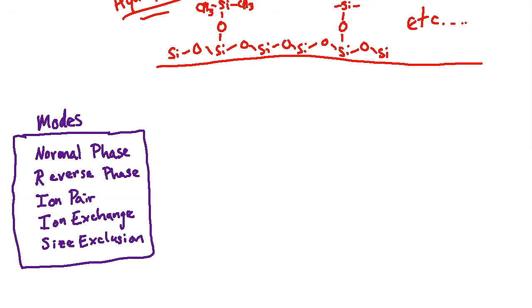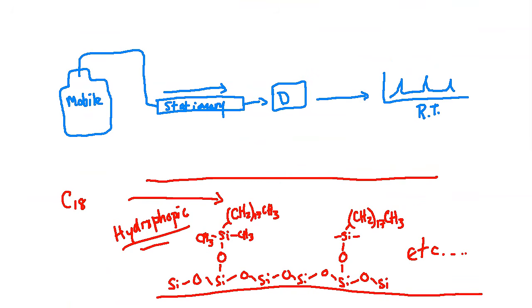So with that being said, I want to bring up an image here as we get ready to start wrapping up this first lecture and really go through each of the parts of an HPLC, because it's one thing to talk about it in theory with this simple drawing I have up here in blue, but it's another thing when you actually walk into a lab and you see the HPLC.